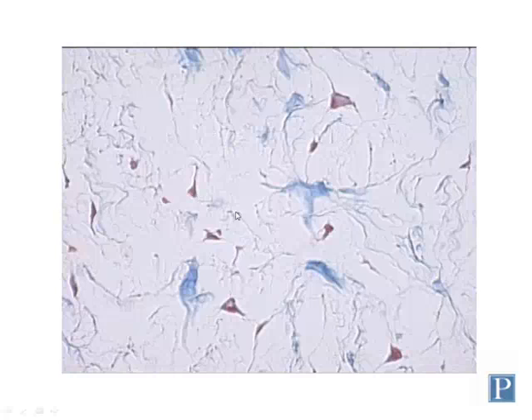This particular slide stains the collagen fibers in the matrix a bluish coloration, so these are actual fibers in the matrix here that are staining blue, and a counterstain has been used to stain the fibroblast cells a reddish color. So there may be other fibers in the matrix as well, but collagen is the main type of extracellular fiber that's visible in this slide.